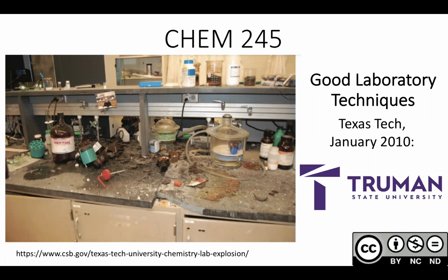So this incident happened at Texas Tech in 2010, where two students were working with nickel hydrazine perchlorate, which essentially is a high energy compound, which is a fancy chemist way of saying explosive.